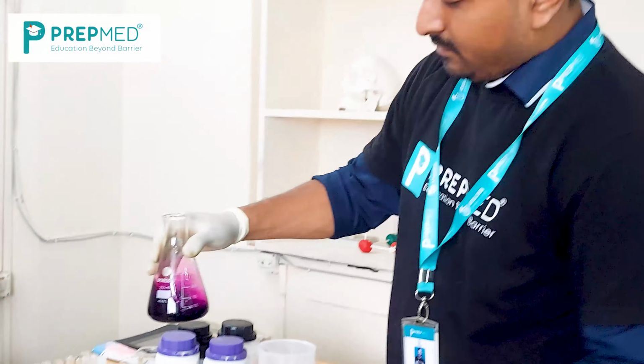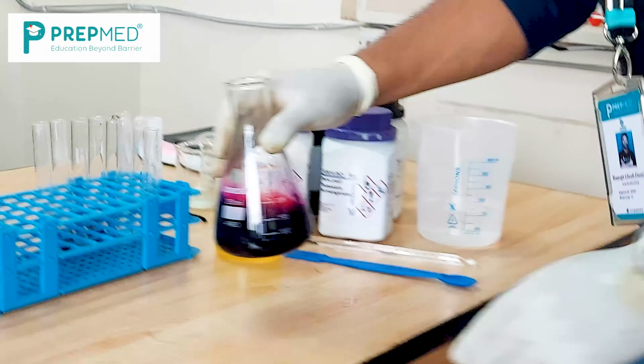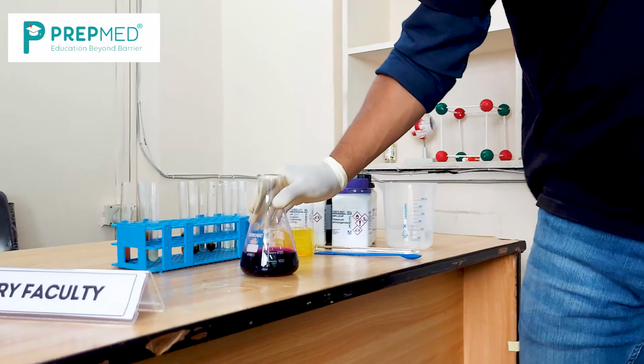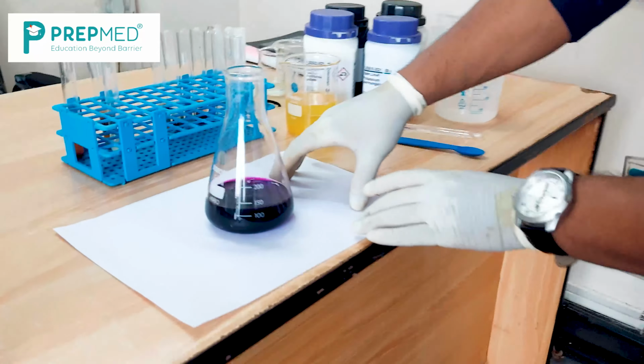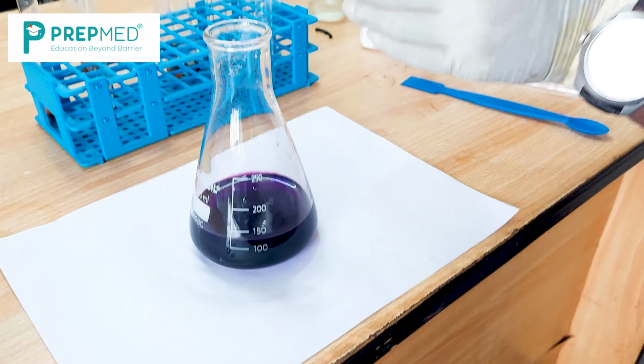Now, very carefully, if you notice, in order to check the color change, let's add that solution.